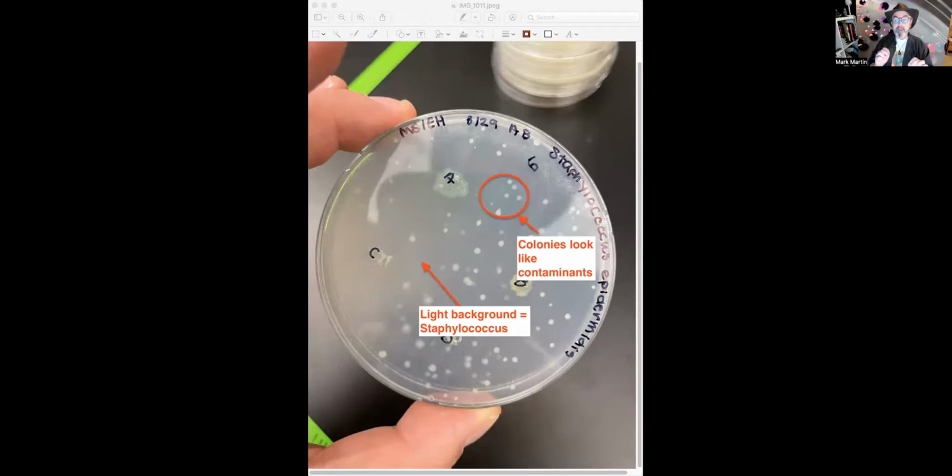It may be possible to see antimicrobial effects from your soil isolates where you are seeing that cloudiness that you see in the diagram. But the colonies that you're seeing, not A through D, but those colonies in general, as labeled in this image, show you that you shouldn't be paying attention to those things. I hope that helps a little bit with that.